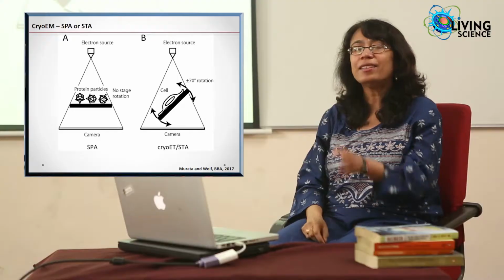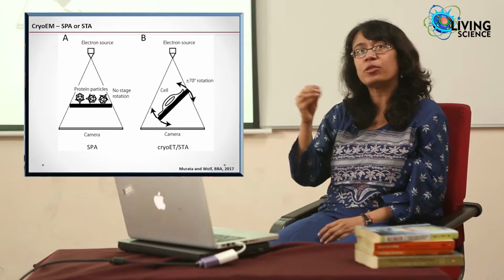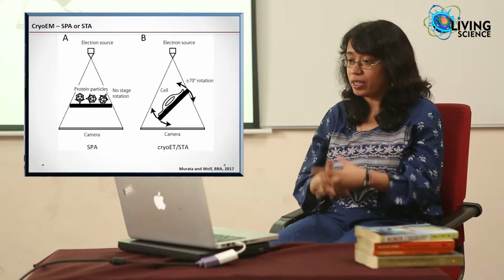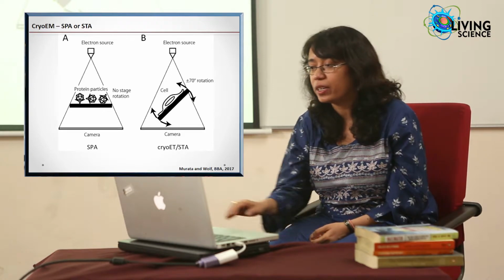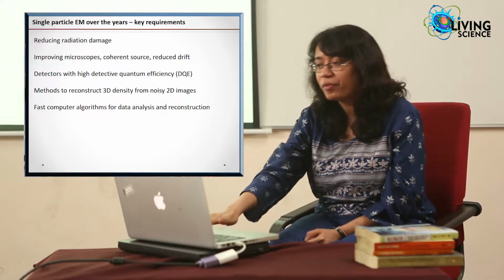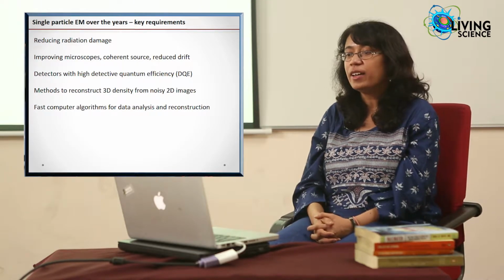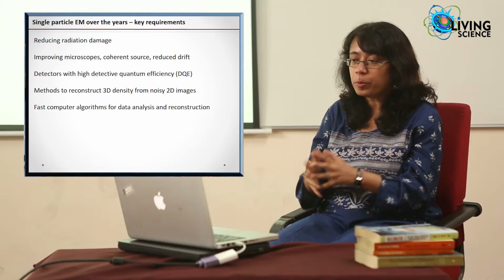And then the sections are aligned, and from there reconstruction of your material of interest can be carried out. And this is where machine learning and neural networking come in, where for identification of this material within cells, people are using neural networking or machine learning techniques, which is helping quite significantly in such reconstructions. So from my initial image that I showed of virus particles without any features, we have come to the point where we can get very high resolution structures of even small protein molecules.